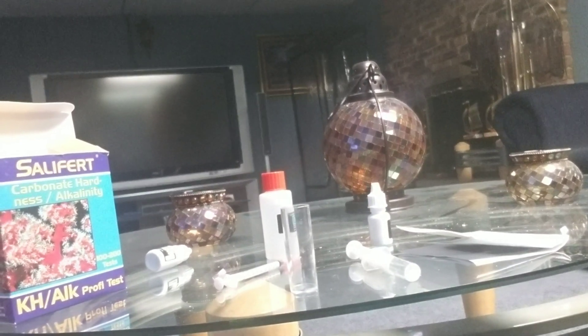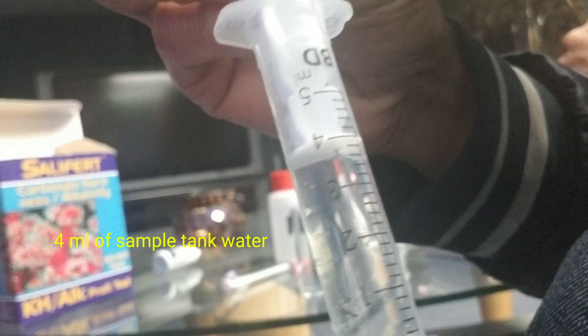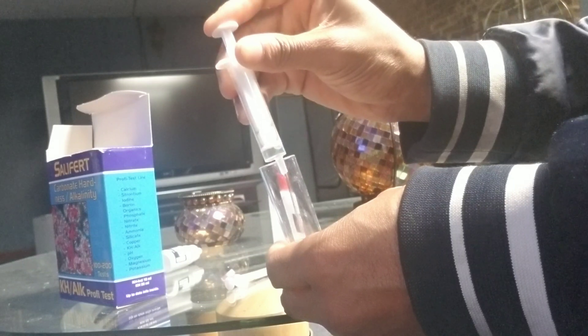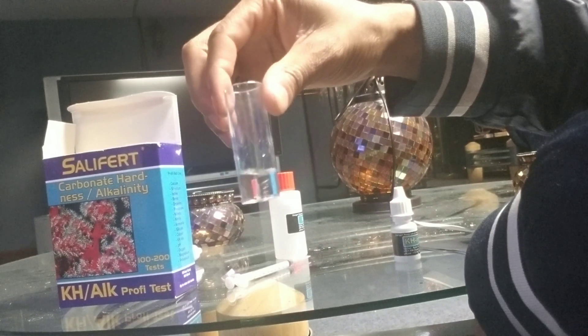How to use a Salifert alkalinity test kit. First, grab four milliliters of sample tank water from your main display. Put the tank water into the test vial — four milliliters, remember.